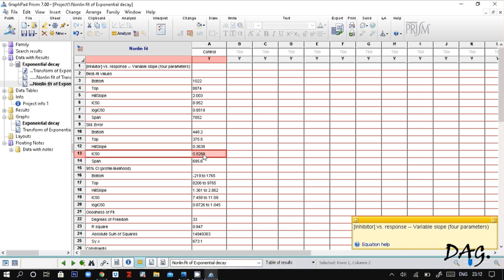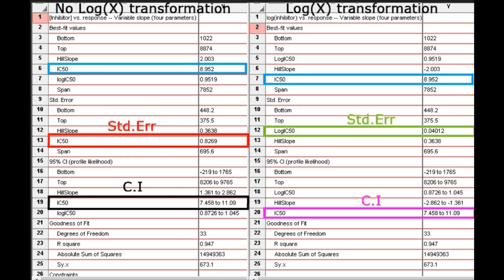This is the value we are interested in. Now I want us to do a comparison of the data from both analyses. Here we have the data in the case of no log transformation, and here we have the data in the case of log transformation. As you can see, the IC50 values are the same — in fact almost every other value is the same, except for hill slope, which differs by a negative value due to the log transformation. Without log transformation, GraphPad Prism provides the standard error of the IC50 value; when log transformed, it provides the standard error of the log IC50.